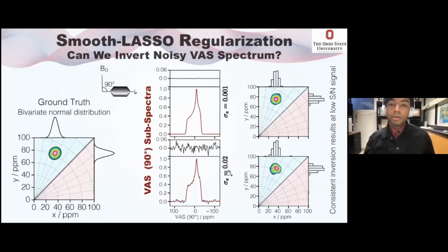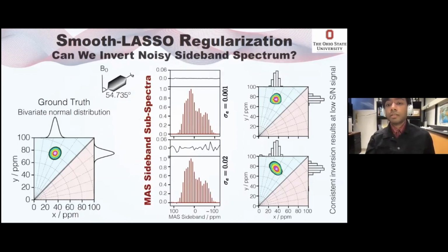And the second part of the uncertainties comes from the noise, which I've shown here. If you have more noise, you get more of these uncertainties, but that's true for any approach, even the least squares problem. And if the question is, can we determine the extent? I would have to say at the moment we don't have the ability to say what part of this is zeta and which part is the uncertainty, because all of them lump together.